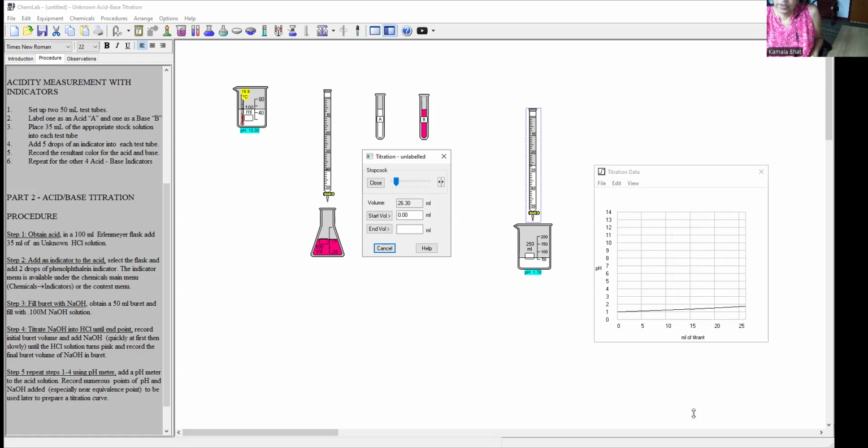And so now you can see that the titration is carried out to 25 mL. Still, the pH is rising, but not rising to that large an extent. At the neutralization point, there will be a sudden sharp jump in the pH, and you can see that visually as the experiment proceeds on.